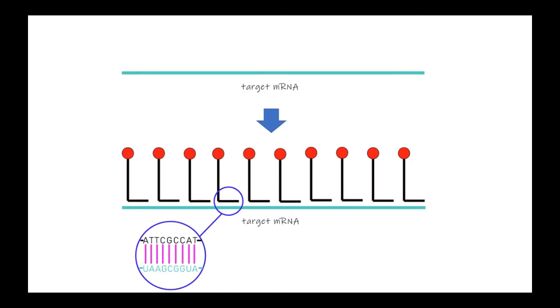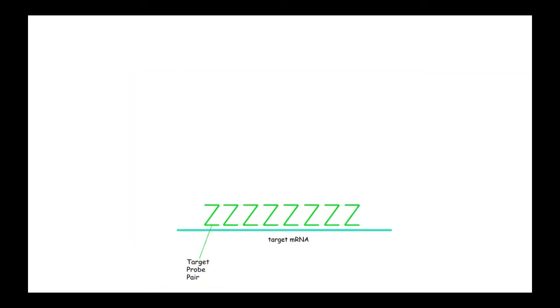It would not be so bad to use several small complementary oligonucleotides conjugated to some fluorescent molecule. They will multiply the signal when hybridized to this mRNA. But branched DNA technology utilizes some kind of chain of hybridizations. It has the first level of amplification called target-probe pairs.